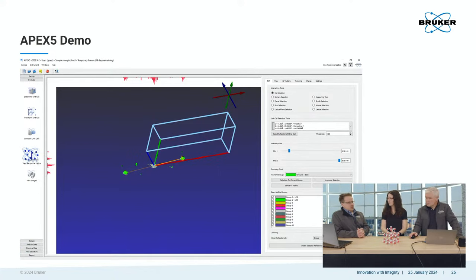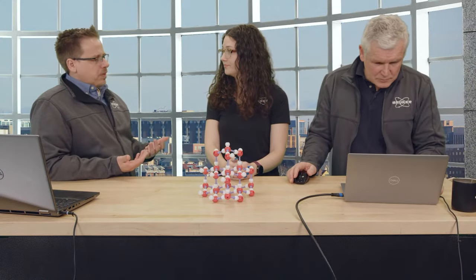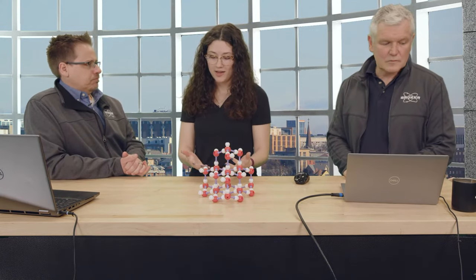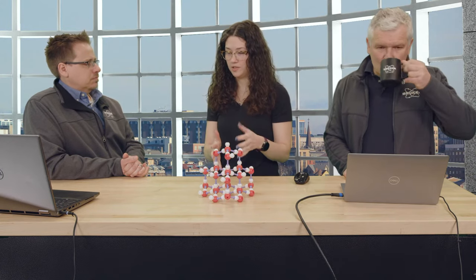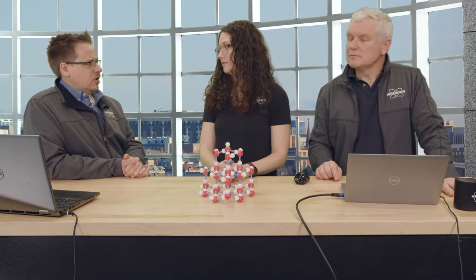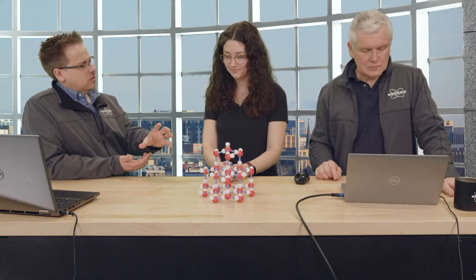So now in terms of data collection, Ashley. Do you need any special requirements on your machine in order to do this type of analysis? What we recommend is just a very bright source and nicer, newer, stronger detectors that really help you to see those lower intensity satellite reflections. All right. And then in terms of intensities of sources, I know there are classic sealed tubes.